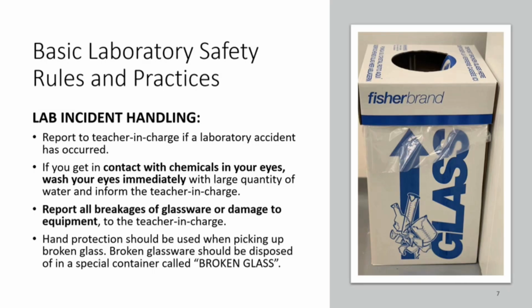Report all breakages of the glassware or equipment damage to the teacher in charge. Hand protection should be applied when picking up the broken glass. Broken glassware should be disposed in a special container called broken glass, as shown in the picture here.